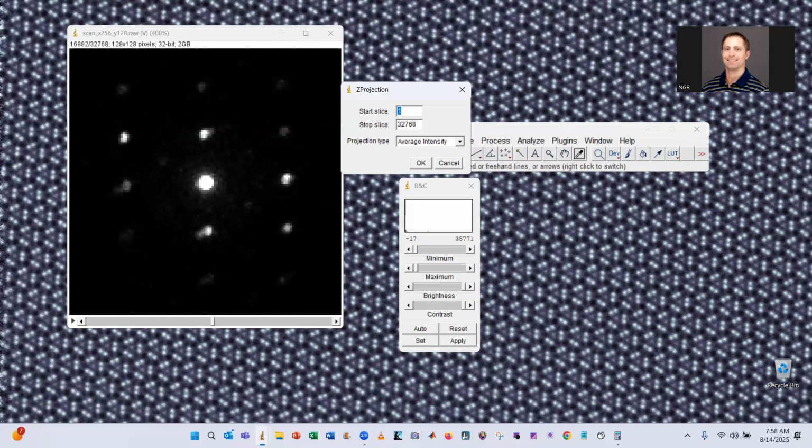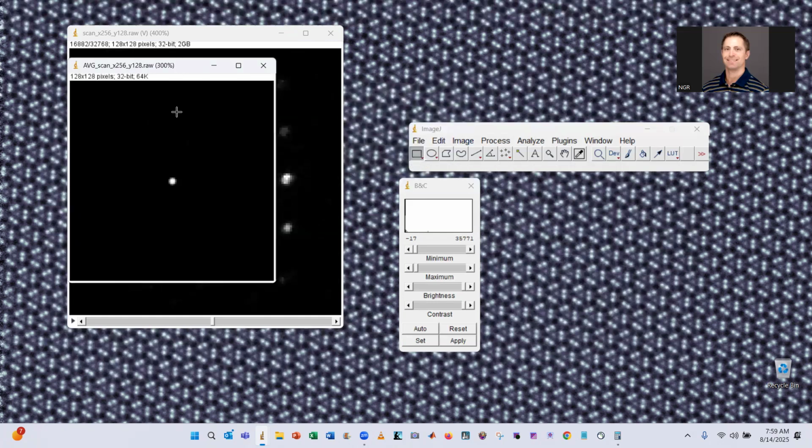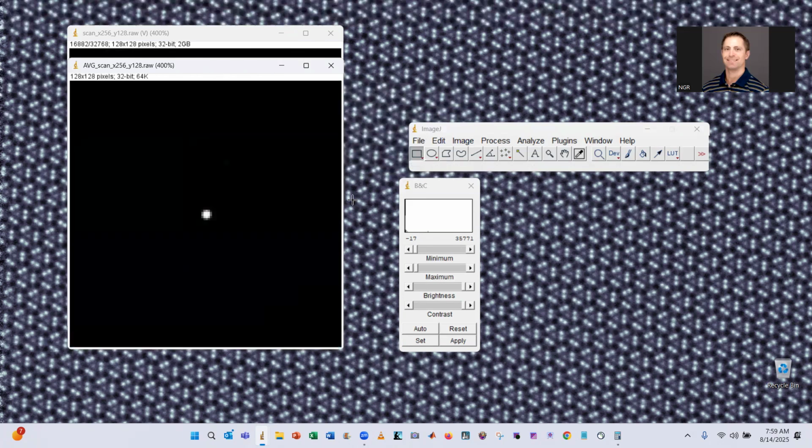So let's do 16885 and let's go to 16895. So we're averaging 11 frames. And let's see how this improves things.